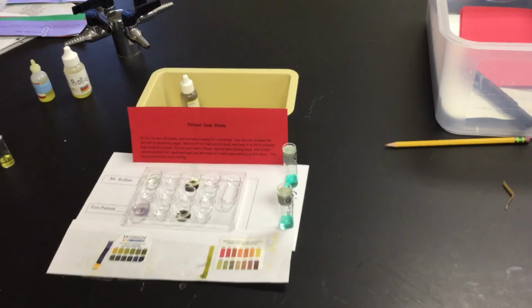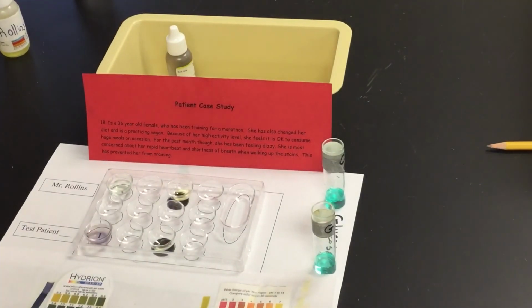The only thing that you have left to do from here is to go through and look at the microscopic view for patient number 18. You will copy and paste that, put that into your data chart, then go through and analyze the data that you received. Look at the background information on that particular patient and see if you can determine, based on the lab results that you got, what that patient may have going on with their system.